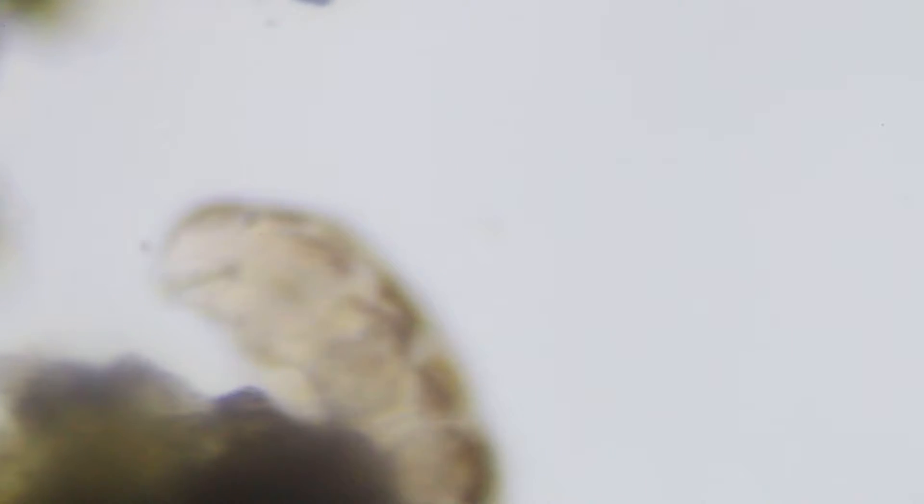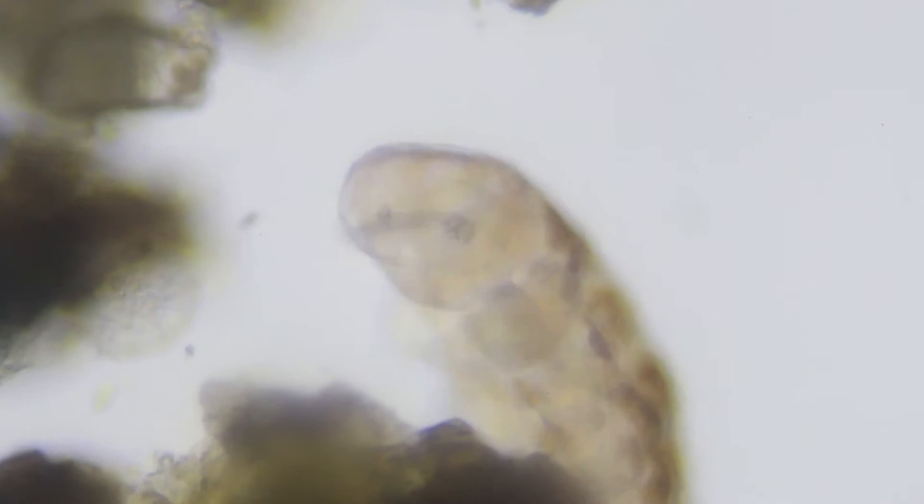Those guys can survive in outer space? What? Yeah! They're like the world's most amazing animals. They can live in hundreds of degrees, plus and minus, and they can survive in space. Some people theorize that water bears might have been how life started on this planet. What? Yeah.